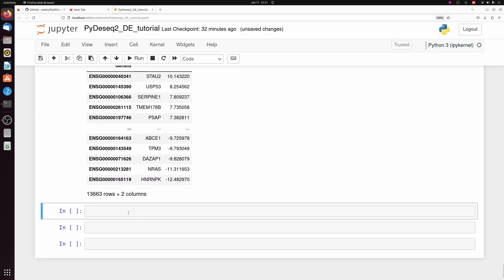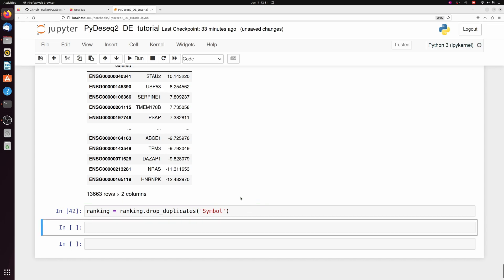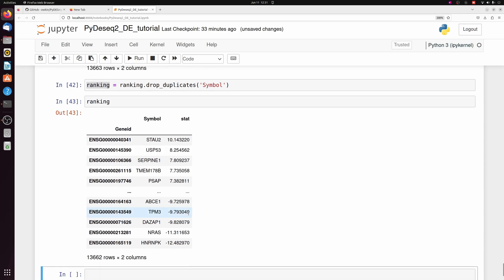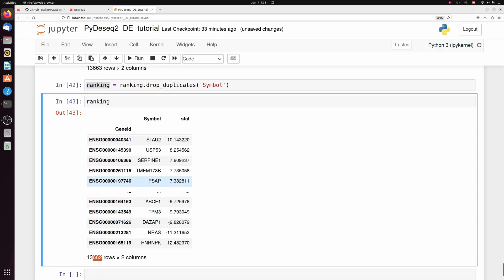And then we also want to drop duplicates. There's going to be a few ensemble IDs that map to multiple symbols. If you really want to figure out what's going on in your data, you can do that. It's just going to be a couple of genes probably and not really impact the pathway analysis overall. Actually, it was only one gene in this whole data set.